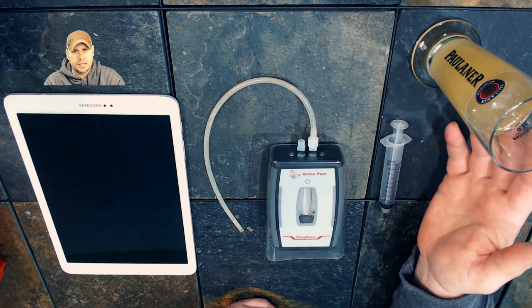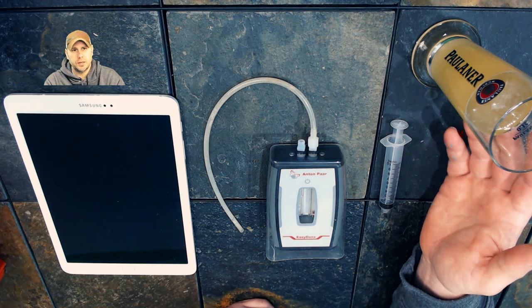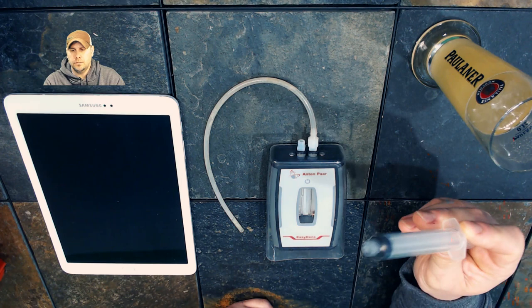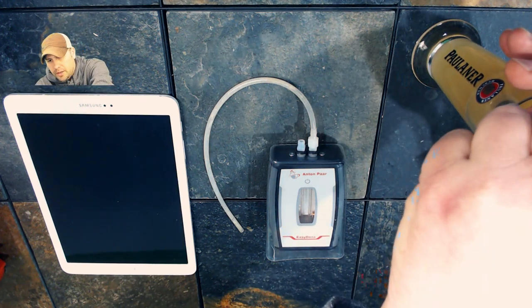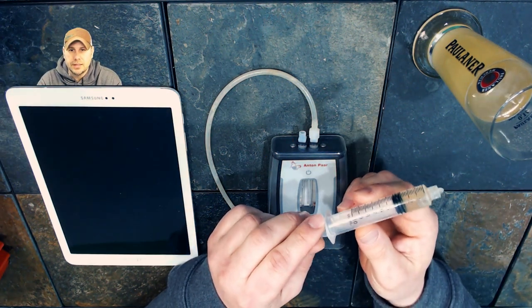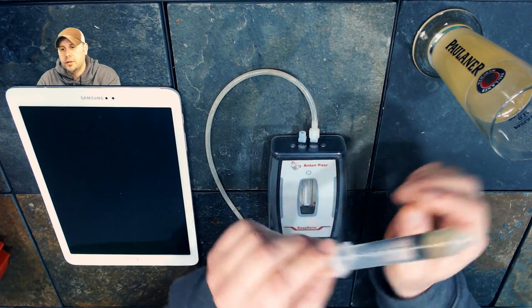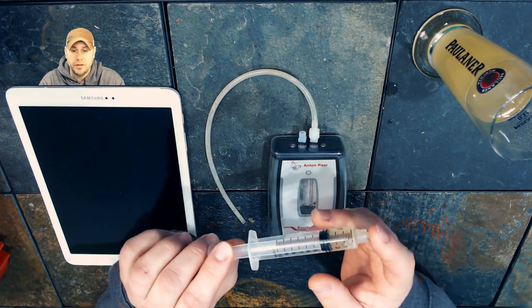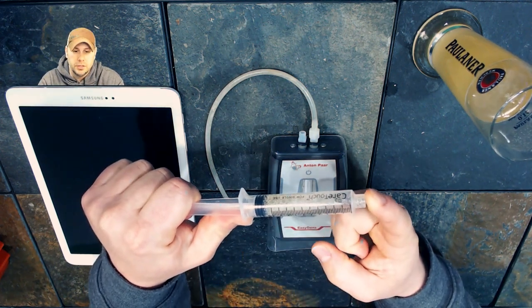So we'll take some of our beer here that we pulled a sample of. I realize the sample is way more than it needs to be, but just for demonstration purposes I pulled a bigger sample — plus I drank my spooning samples anyway, so it's no big deal. The first thing we need to do is pull our sample and decarbonate it. I'm going to pull a three milliliter sample. It can be more or less, but I just use three. We do need to get rid of the carbonation.